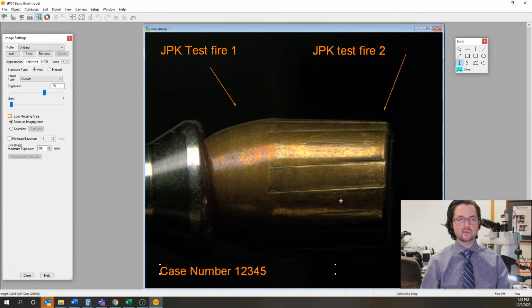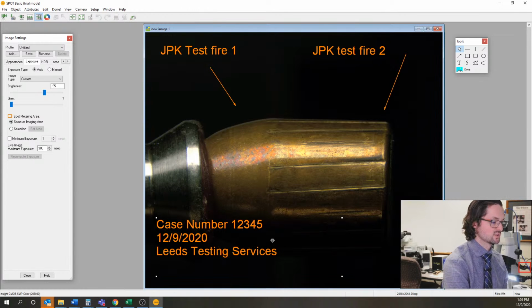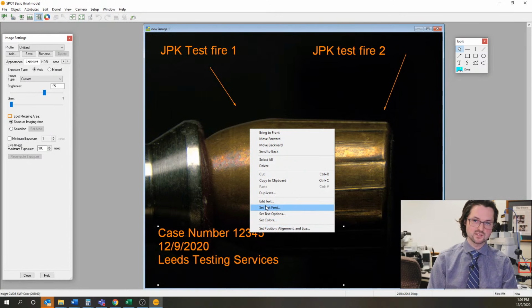And you'll see that I put all that stuff in the text box, but you can't see it because my text box isn't big enough. So what I'm going to do is come over to this little select mode. I'm going to drag this up, and now I'm just going to make that text box bigger. And so you'll see all that. Any one of these text boxes, you can always just right-click, and then you can change the text, font, the color, any of those things.